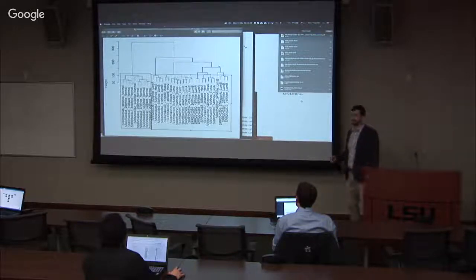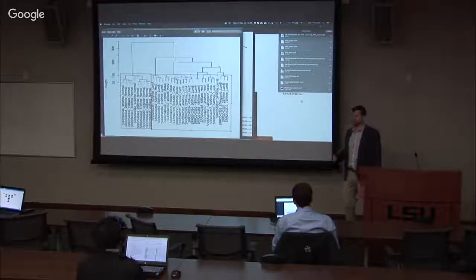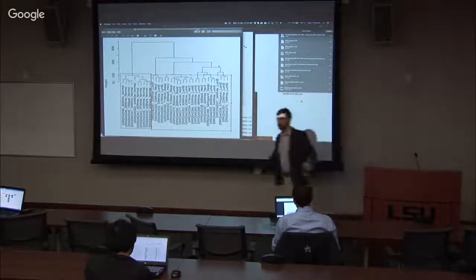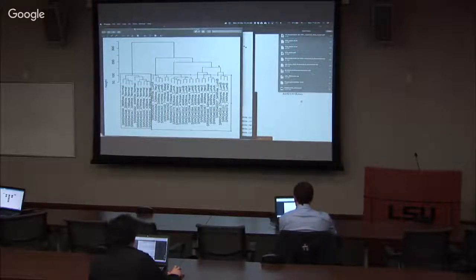Mine is kind of different compared to yours. Maybe you didn't use the normalized. Did you use the normalized data or? Interesting. So I don't know what exactly you used here. It looks like you didn't use the normalized. You used the unnormalized. Which is a good example, right?